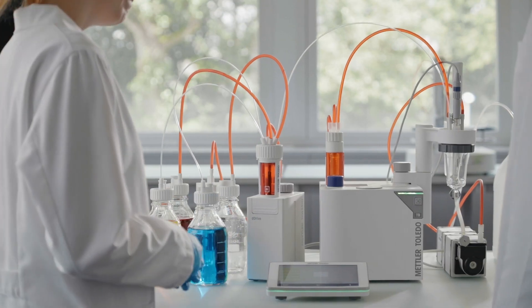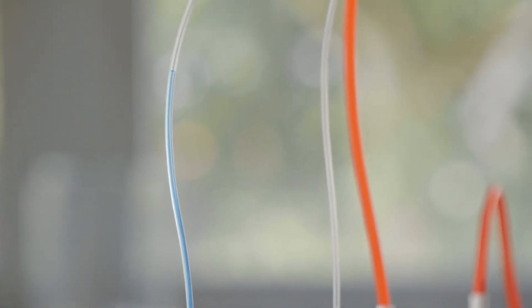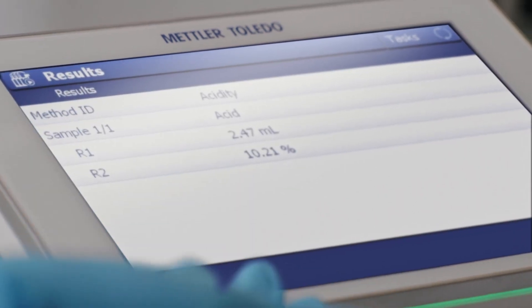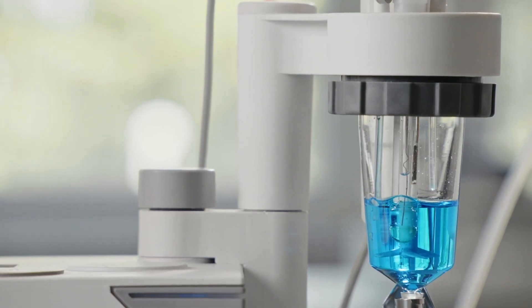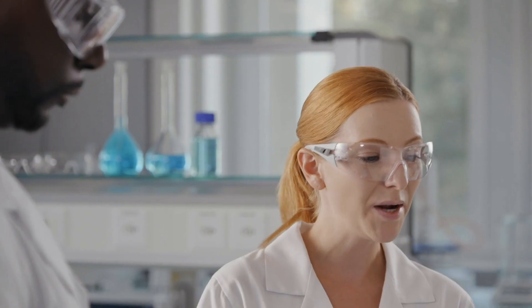And this is it. Just one click and it automatically aspirates an exact volume of the sample and dispenses it into the titration beaker. And here I get the results. After completion of the titration, the beakers and sensors are automatically drained and cleaned, ready for the next samples. No errors. Plenty of time for other tasks. Like, you know, coffee.